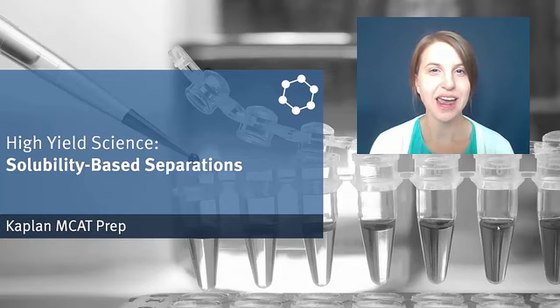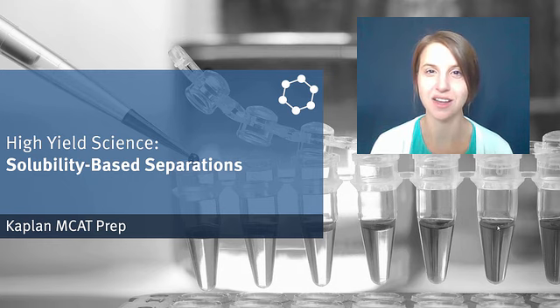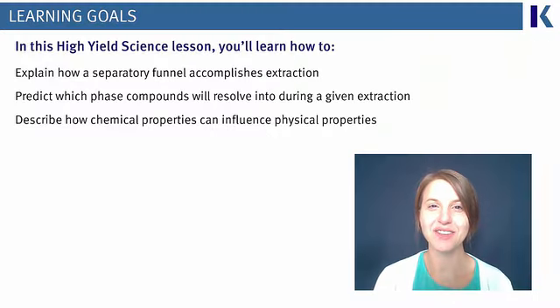How can differences in a physical property be used to separate the components of a mixture? And how can the reactivity of those components affect their physical characteristics? I'm Amanda Swearingen, and these are a couple of the underlying questions we'll tackle during this lesson, specifically looking at solubility-based separations. Within the context of an experimental procedure using a separatory funnel, we'll explore how a single component of a mixture can be extracted.